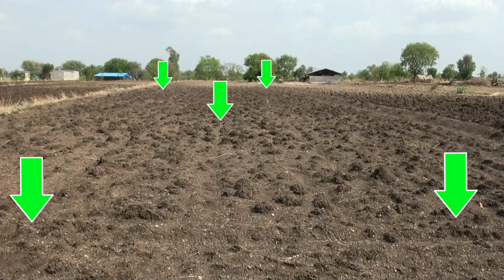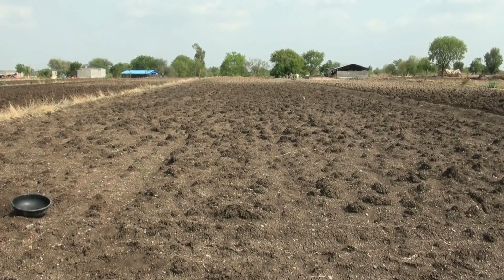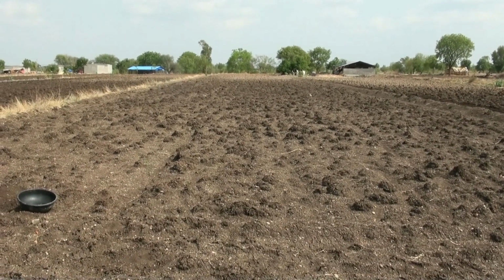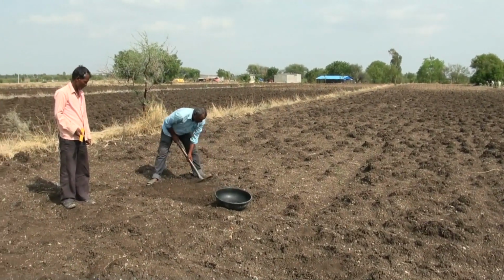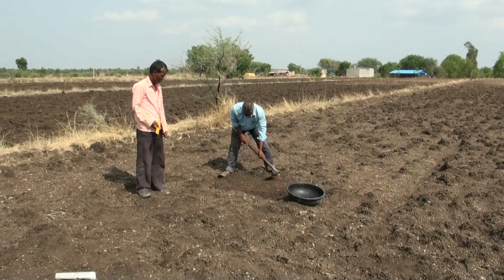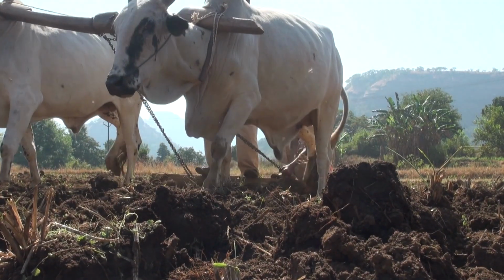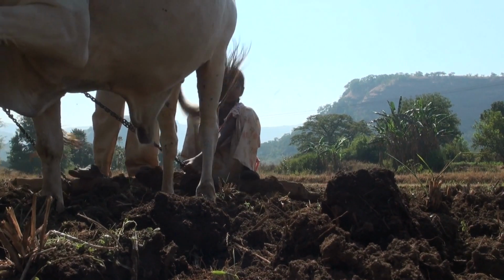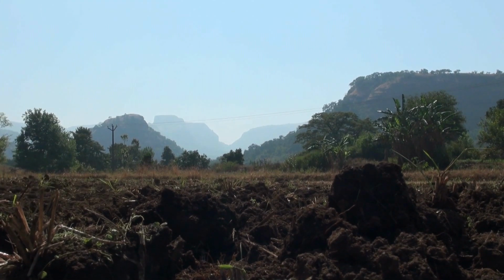Soil sampling can be done at any time in a year, but samples should not be collected when soil moisture content is higher than the field capacity. For example, right after rainfall or irrigation events. Also, avoid soil sampling after manure and fertilizer application. Taking soil sample before the start of a sowing season gives a more suitable representation of actual soil health status and will therefore give precise results.